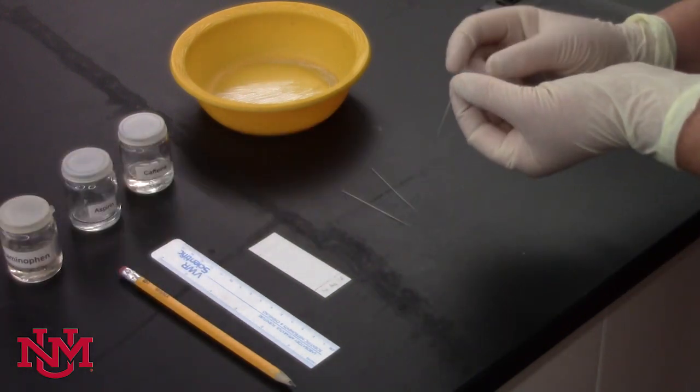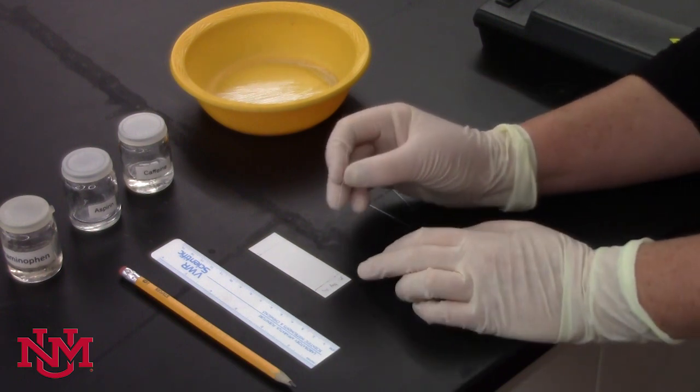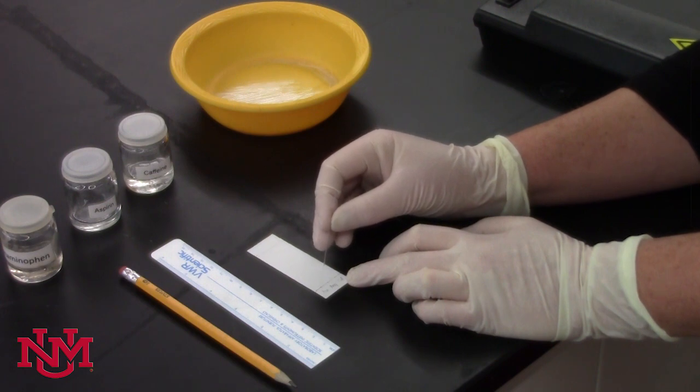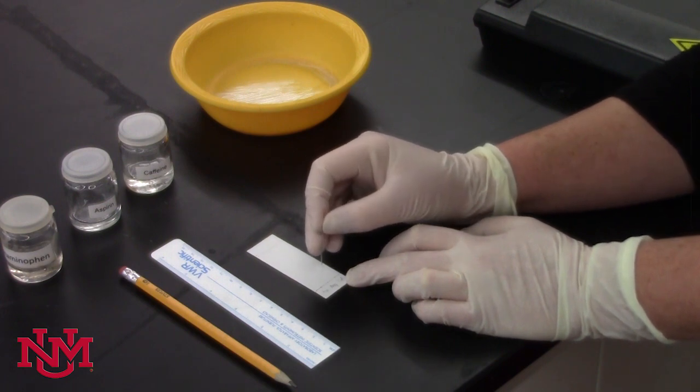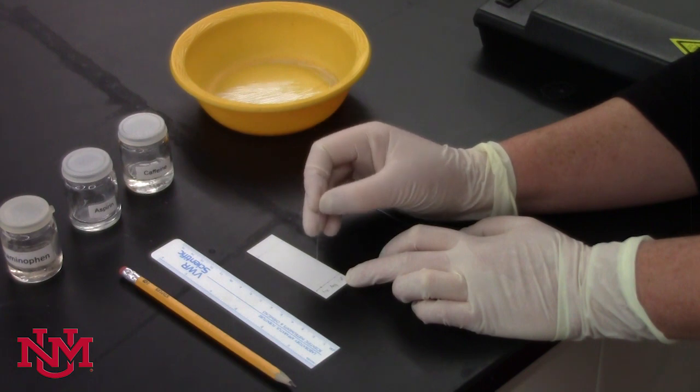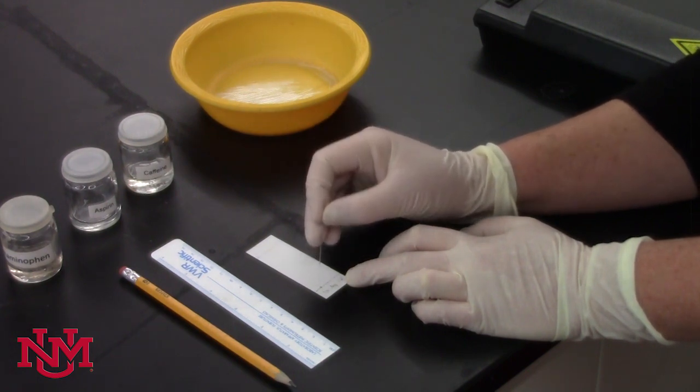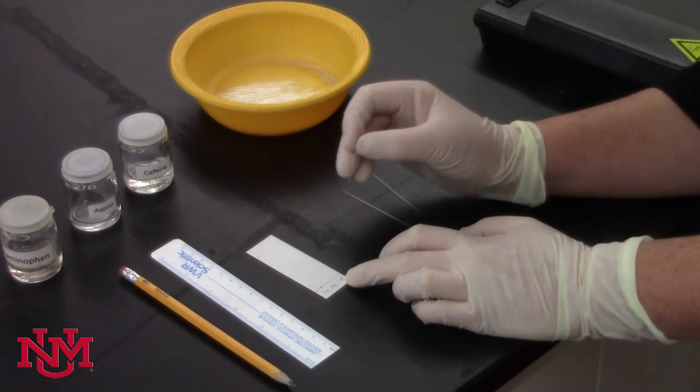After you close the jar, take your sample of acetaminophen and barely touch the end of that glass tube to the dot you've labeled acetaminophen. You'll see it darken just temporarily, and you'll want to touch the plate a few times. This will ensure that you have transferred enough sample to be analyzed.